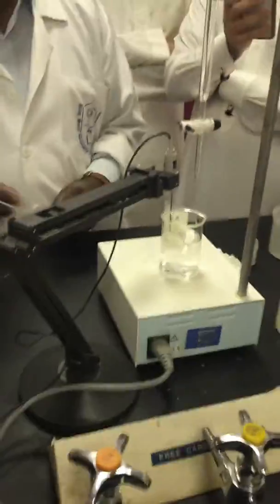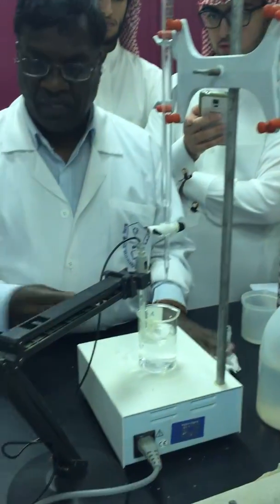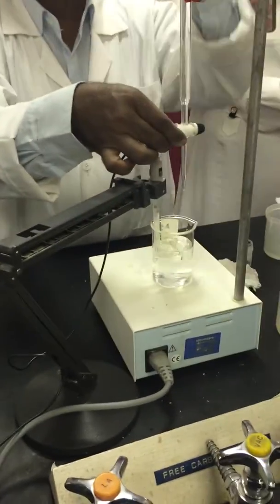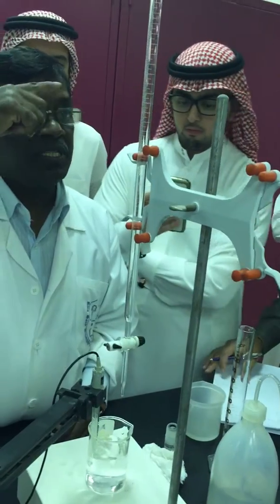Okay, so take this reading, one digit only, because the second digit sometimes changes. Should I take it as 8.7? Yes, you can take 8.7. After this, the burette reading is 0, here is 0, and it should be the same.